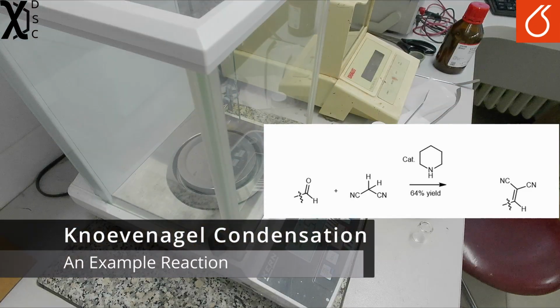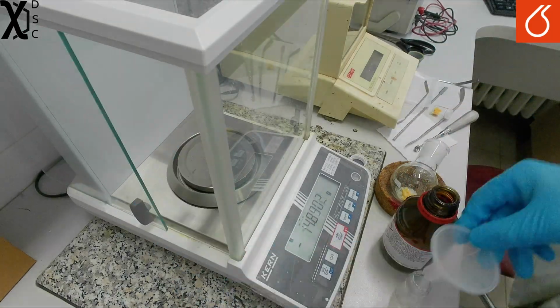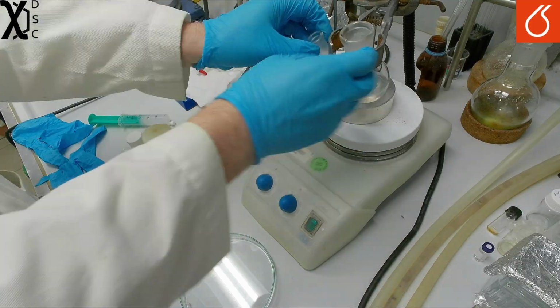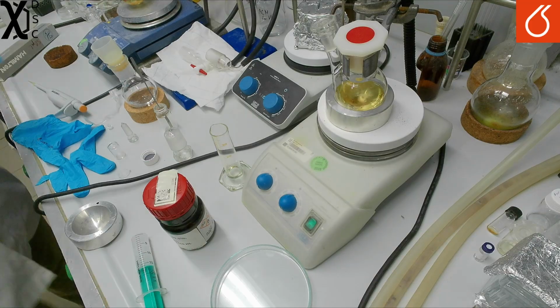This video will show a practical example of the Knoevenagel condensation and then discuss the theory. First you'll see me getting dry THF and then weighing out first 1 gram of aldehyde and then 3.93 grams of malononitrile. The compounds are then poured into a round bottom flask and 30 ml of THF added.